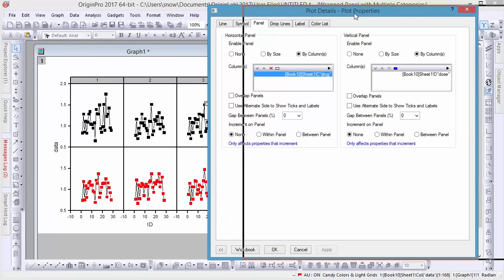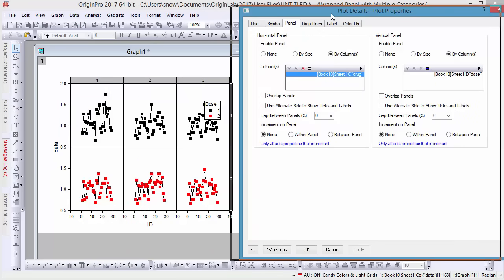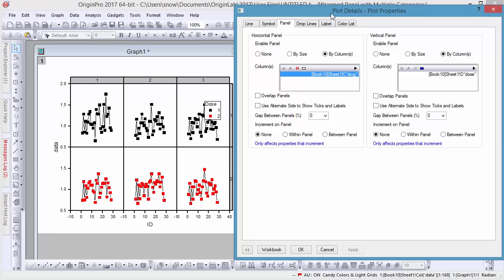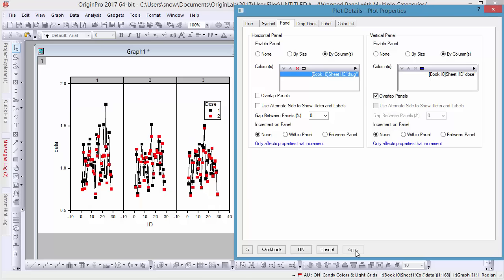Rather than having to merge two separate graphs, you can overlap panels in one or both directions to better illustrate the differences in your data.